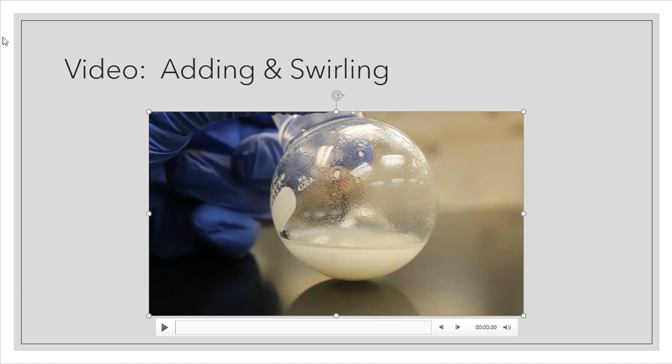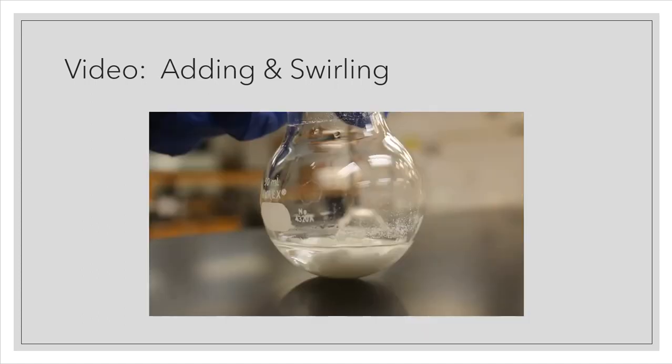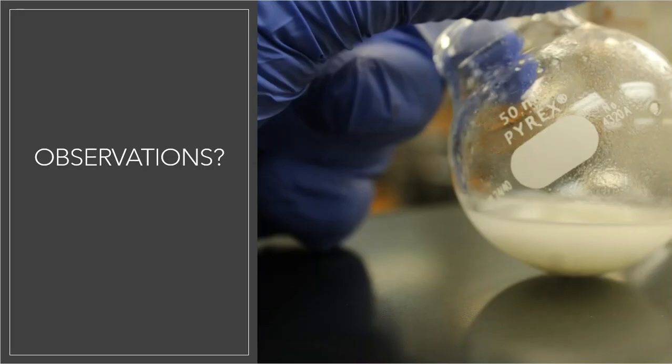So I've added those two reagents together. I mixed them very well. You can make your observations after the mixing process happens. A little bit of a close-up picture of what goes on. Did it all fully dissolve? Did it get cloudy? Did it stay clear? Did it turn color? Those are the things that you want to write down in your laboratory notebook throughout this process.